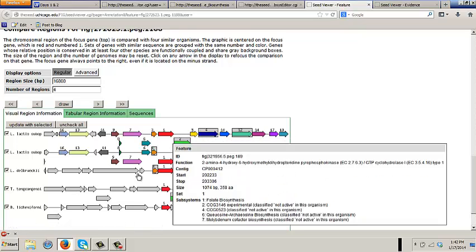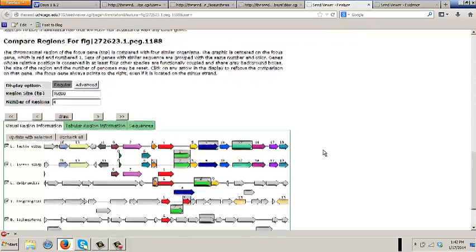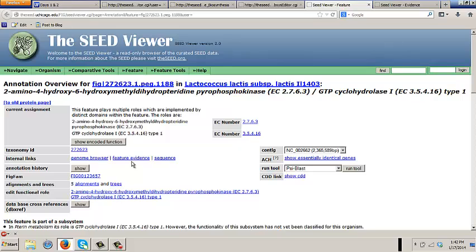I didn't want to do the sidetrack, I'm just explaining why the name is so weird: feature evidence, so that it would pertain not only to proteins, but to other objects you can encounter on a chromosome. So remember, it's a genome collection, a genome database. It's not just protein. You're probably used to PFAM and other collections, where all they have is proteins. So we have the underlying DNA, we have RNAs, proteins, regulators. So it's everything that you can derive from a genome, more than proteins.